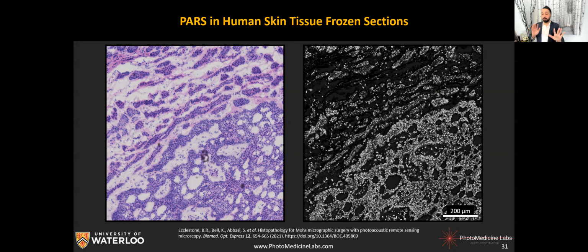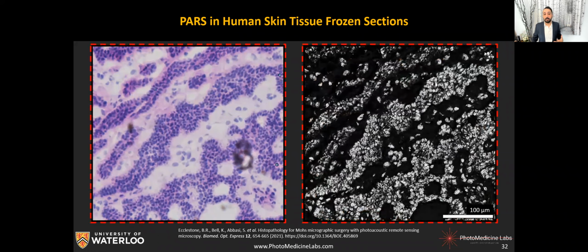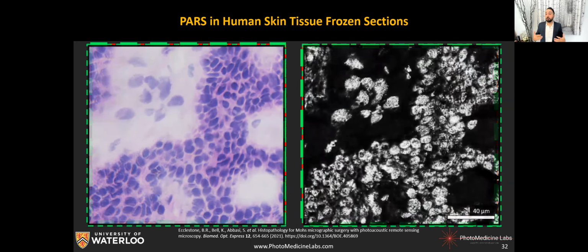So we get the first ever 1-to-1 true comparison. And then we see how nicely, actually, if we zoom in a different area, this structure now can match and be able to get this 1-to-1 comparison.